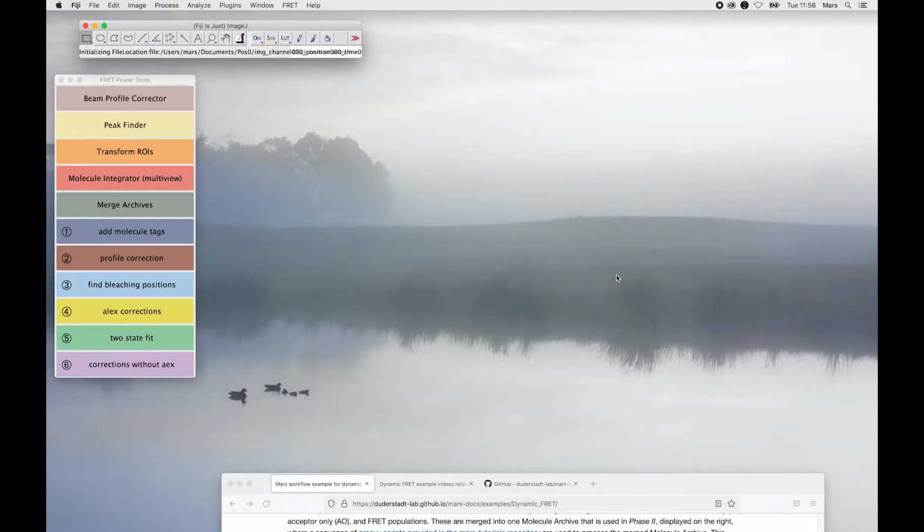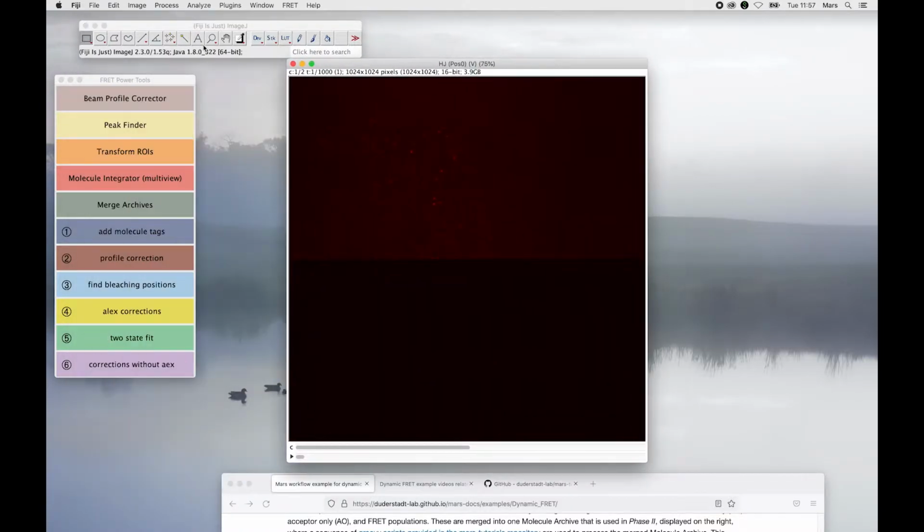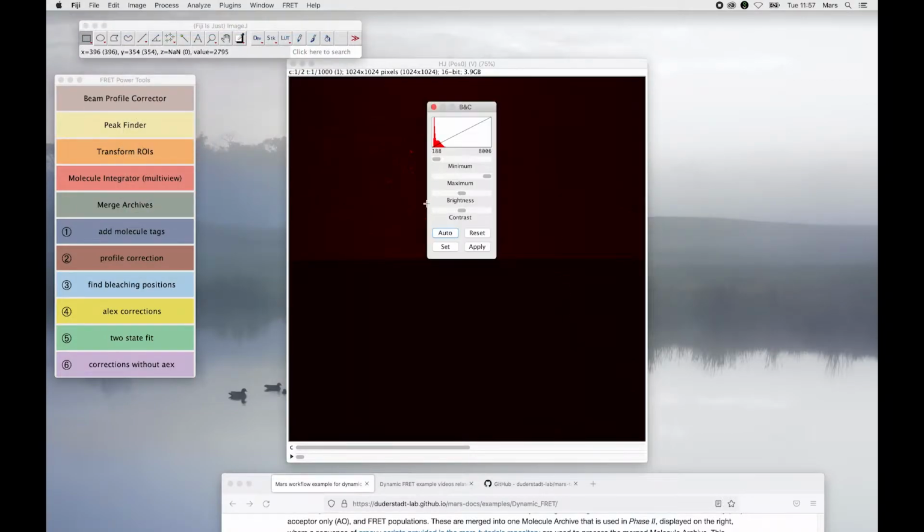So it's a relatively large video, so this takes a little while. I've also noticed when you repeatedly open these videos, it actually speeds up over time. All right, so here's our video. I'm going to go ahead and adjust the brightness and contrast.